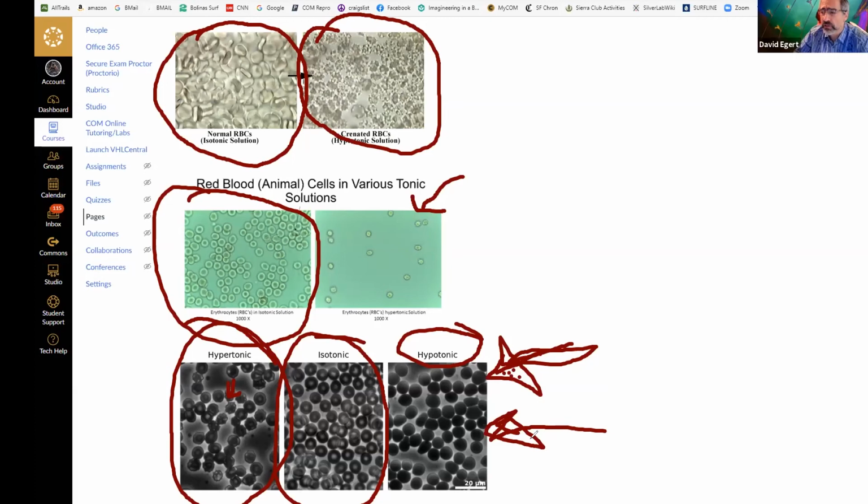No, 7, that was the sucrose, that would be completely isotonic. I'm sorry, 7 on ours was urea. No, urea is going to be, what happened to the cells in urea? They lysed. Here we have cells that are intact. They're just kind of bloated looking. Maybe number 3, if they're healthy new cells. Exactly. So these are the ones that are slightly hypotonic. They've taken up water, but they haven't exploded.